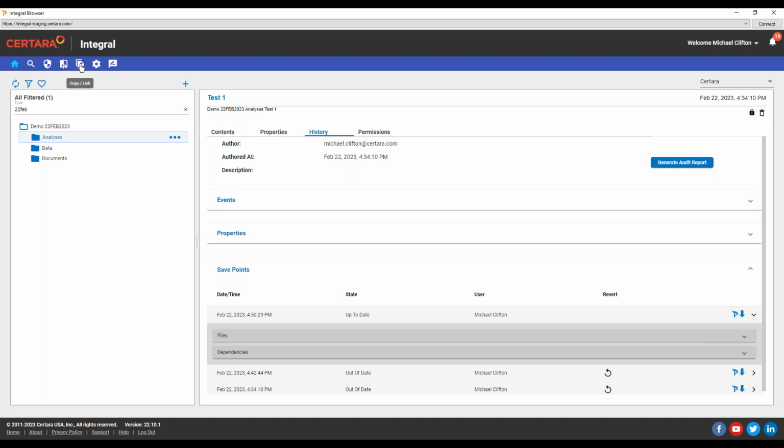There's also a way of creating copies of files, as well as linked copies of files where the copy is dependent on the source data. So any updates that are done to the source data will affect the copy that was made, and you could update the copy using that link.